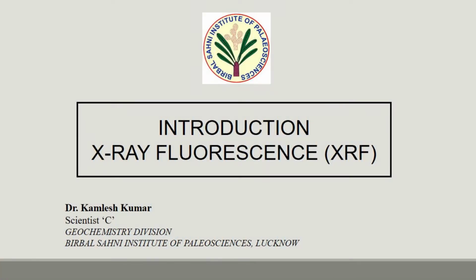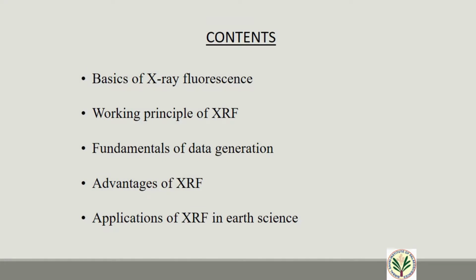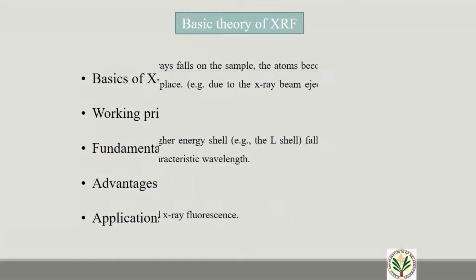In today's module, I would like to introduce you to a brief of X-ray fluorescence and its applications. The main contents are the basics of X-ray fluorescence, the working principle of X-ray fluorescence, fundamentals of data generation, advantages of X-ray fluorescence, and its application in the earth sciences.